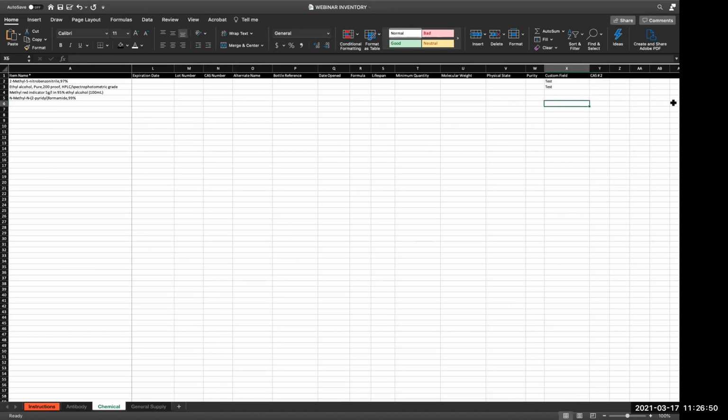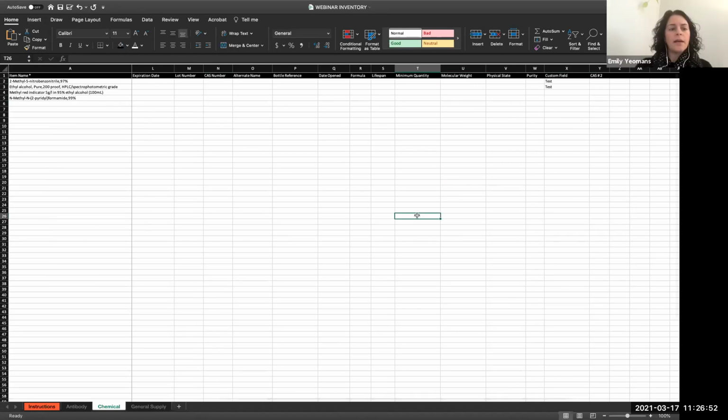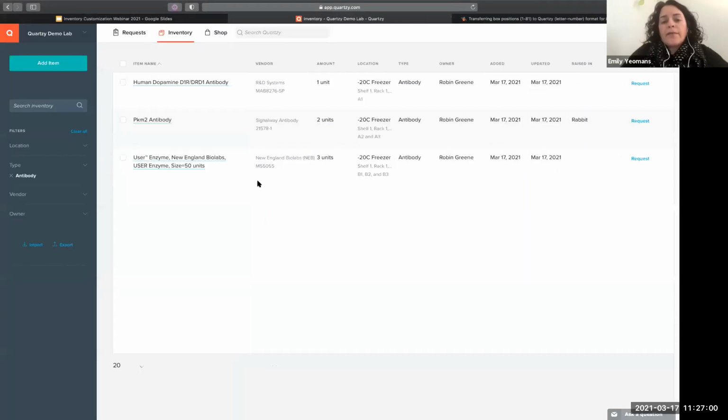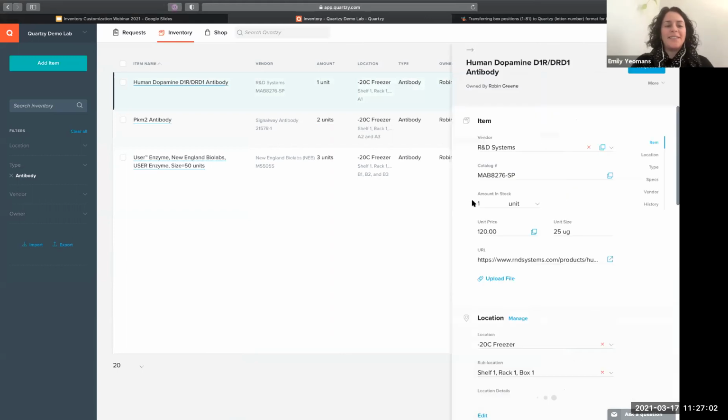And I'm sorry, what was the other question? The uploading SDS information. Yes. So let me go back here. Thanks for all the questions, everyone. I'm trying to get to all of them.